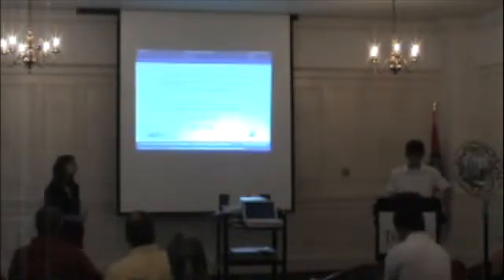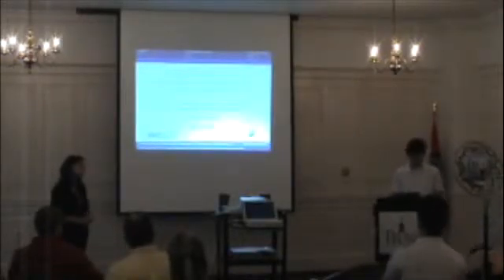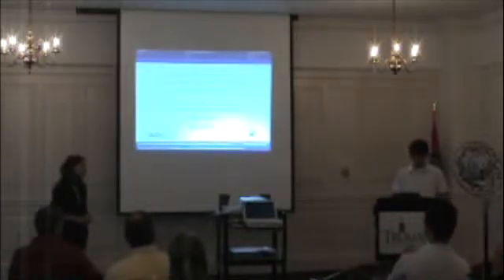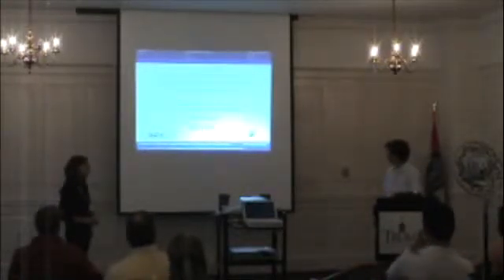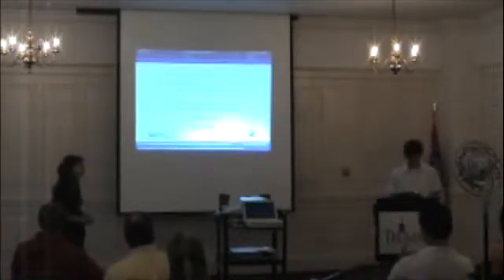As Dr. Walston said, I'm Kurt Warnhoff, and this is Allie Merman, and we've been working under the guidance of Dr. Walston and Dr. Thatcher. And today we're going to be discussing our summer goal of creating an automated scheme for image segmentation for the 4-cell stage of Caenorhabditis elegans embryos.